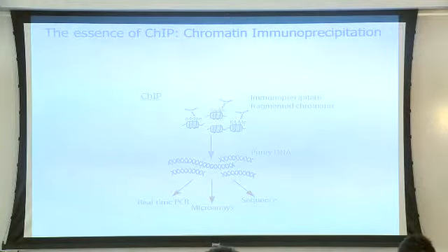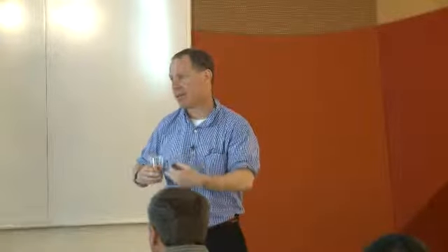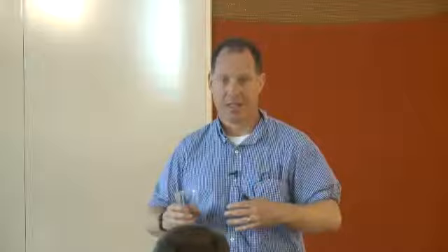So for the next few minutes, I'd like to go into a lot of detail, from the perspective of a group that is doing a lot of high-throughput chromatin immunoprecipitation, into all the methodological choices that we entertain as we pursue this method today. I think the value of this is for those of you who are using ChIP in your research, or are contemplating using ChIP in your research, and are confronted with a tremendous methodological diversity that you need to wade your way through. What are some of the rationales behind doing things one way or another way?